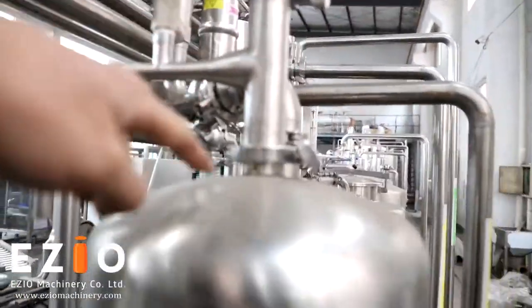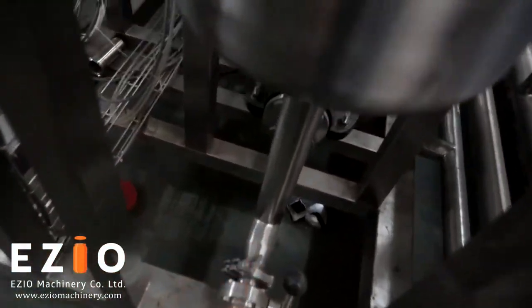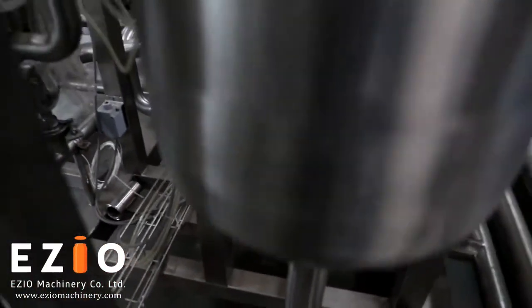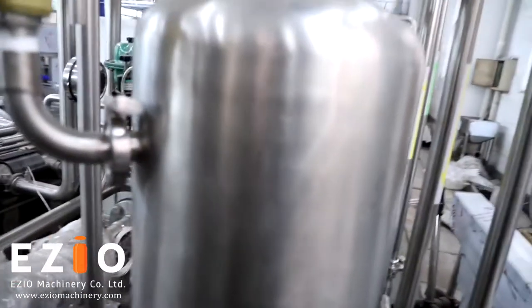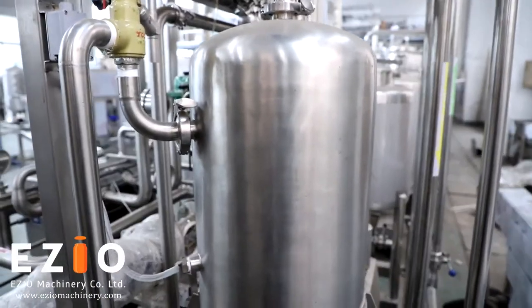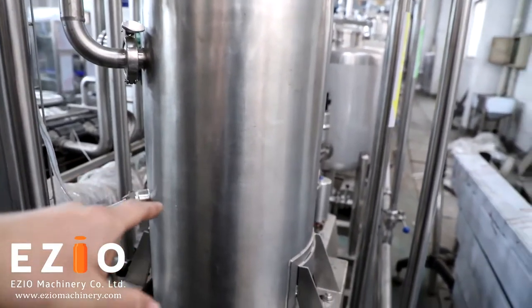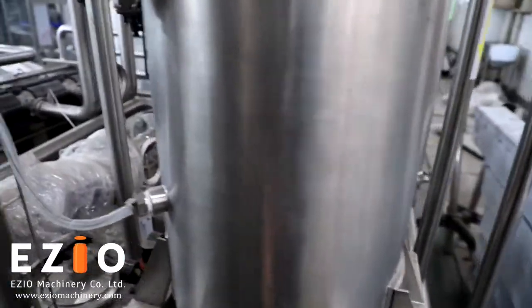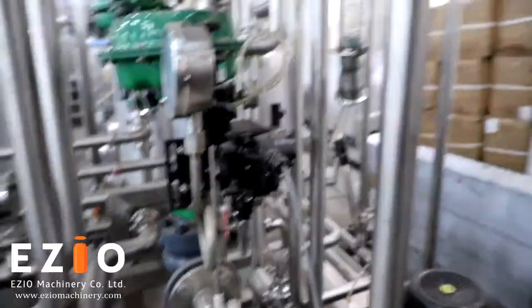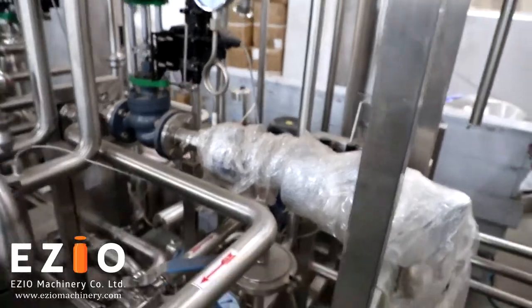The water will come from the top, go through the tank, and go into the pump. This water is for heating and the heat exchanger. The water tank can be pressurized to ensure the water is heated enough and to improve the heating efficiency for the exchanger.